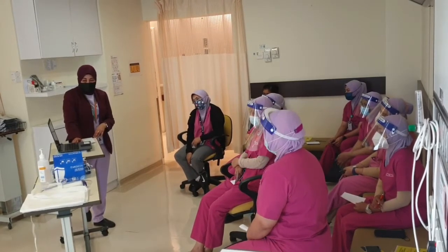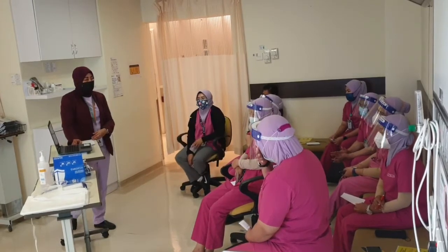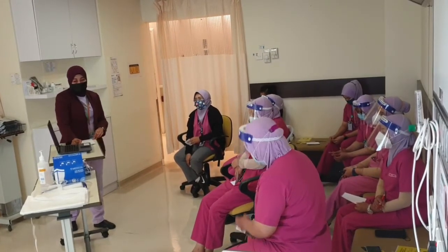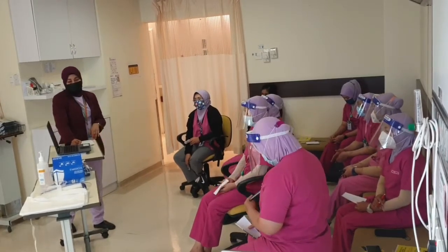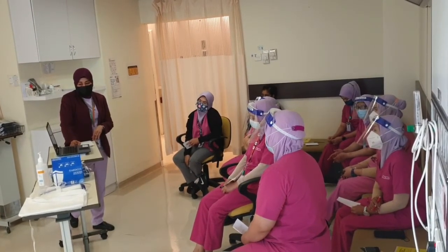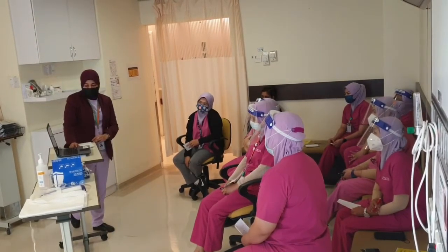Goggles or face shield are also the same. The outside of the goggles or face shield is contaminated. If your hand becomes contaminated during goggle removal, immediately wash your hands or wipe with alcohol-based hand sanitizer. Remove goggles or face shield from the back by lifting the headband or earpiece. Discard in the waste container.